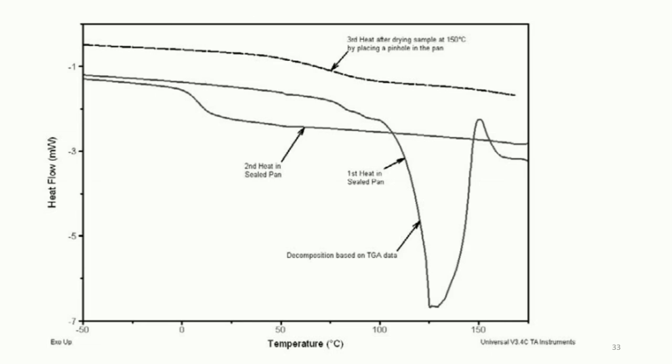Separation of complex transitions into specific components greatly improves the interpretation of results. In general, modulated DSC provides several advantages over traditional DSC.